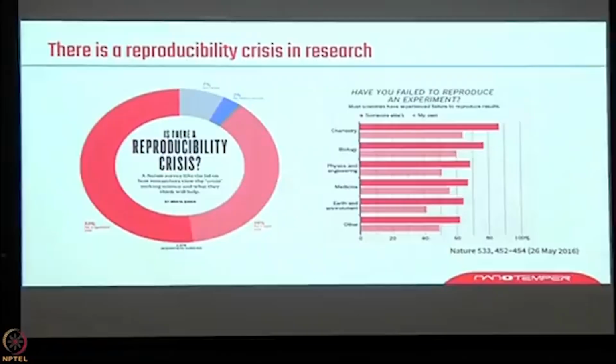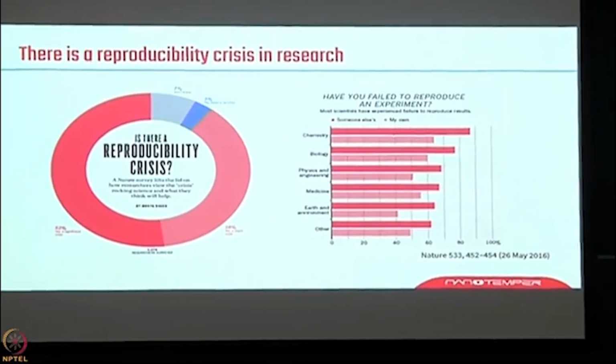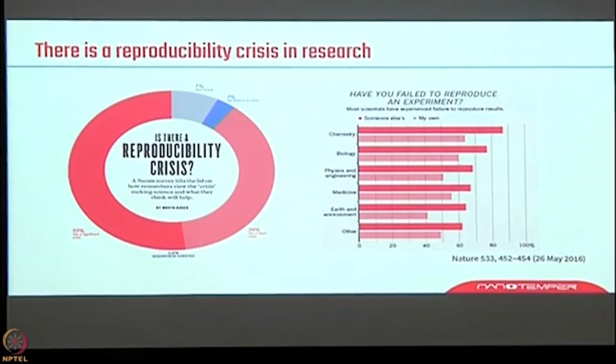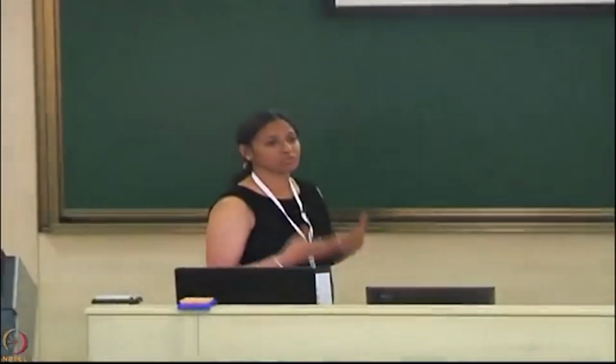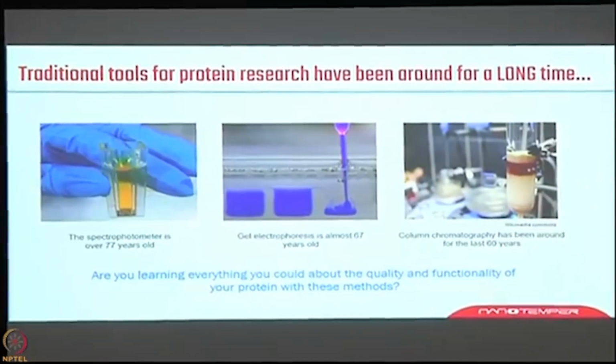Saji, please go ahead. Have you ever asked yourself whether the protein you are purifying is pure or not, and whether it can be used for your future assay experiments? That's a very big question that always comes to the mind of any researcher. Before going for any assay, you run a column, you do an SDS-PAGE, or you do spectrophotometric analysis. These are very standard gold methods, like spectrophotometry, electrophoresis or column chromatography, but still you're not aware whether your protein is a functional protein or not.